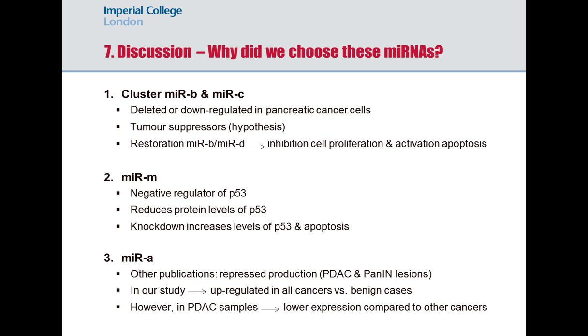One explanation I can think of is that the release of these microRNAs varies depending on the type of sample analyzed. And it's demonstrated that microRNAs from tumor tissues present different levels of microRNAs when compared to the levels of microRNAs in fluid.